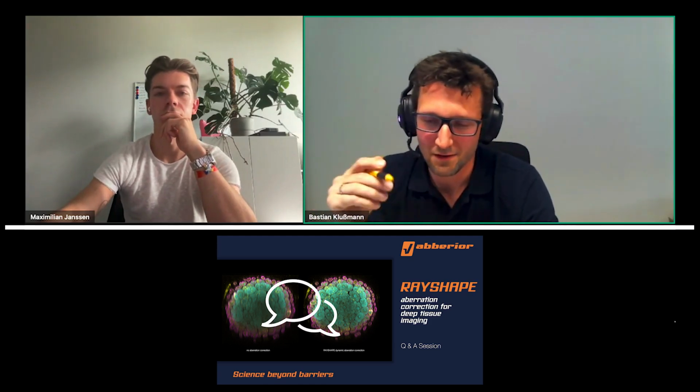So you saw that during my talk. You have those two sliders, you activate the deformable mirror, and then in the beginning of a session, you make an XZ section through your whole sample, and then you set correction values for the top and the bottom of your sample, and you can reuse all those settings over and over again across your whole imaging session. And this works really well. I think I mentioned that even if you have an older sample you already worked with, you can reuse the settings you used before, and this normally works fine, as long as you don't have an air bubble or something like that in there.